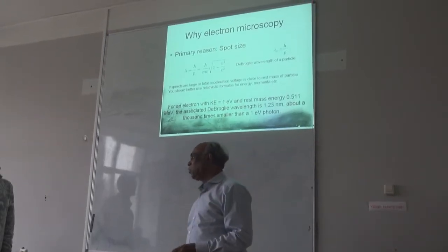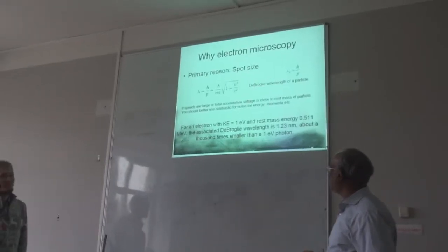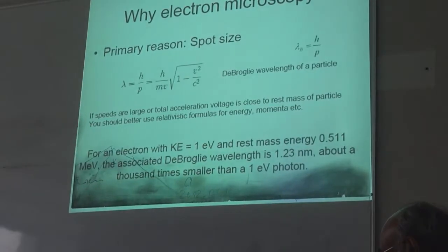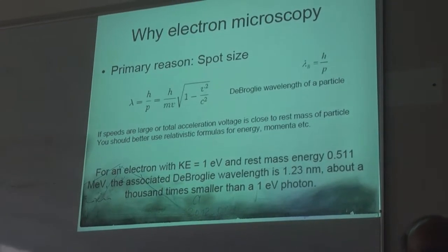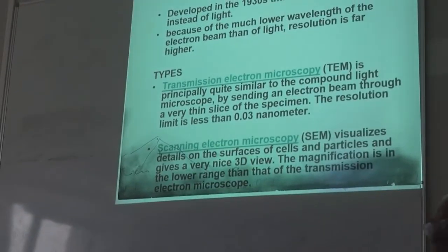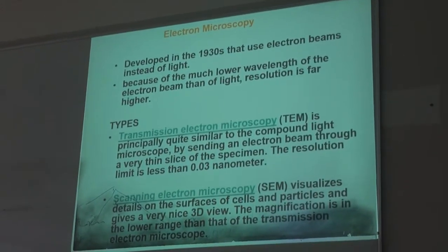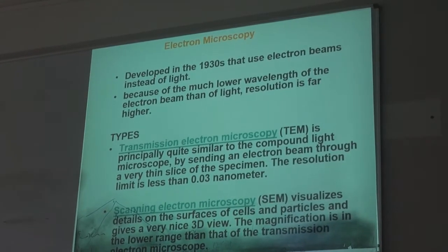Do hundreds of nanometers, right? So that's why in this talk, mostly I'm going to talk about electron microscopes to study nanoscale features. There are two types of electron microscopes. I don't know whether everybody is familiar with this. Everybody knows, right?